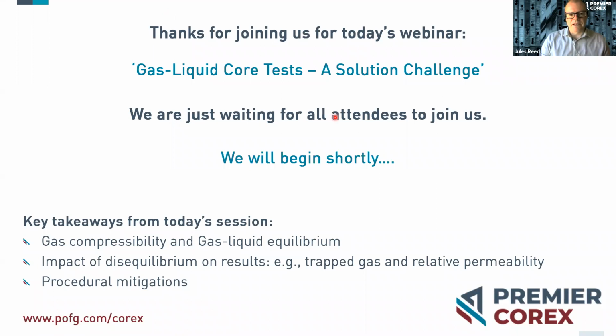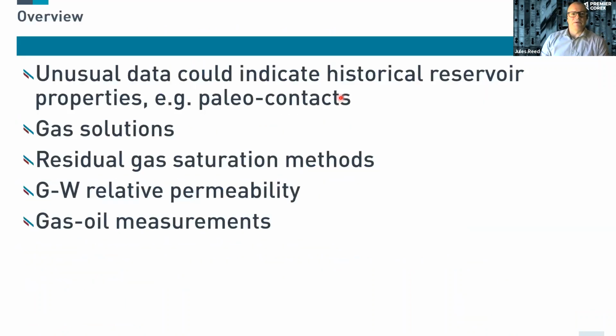As Jennifer said, today I'll be discussing gas-liquid core tests and some of the challenges and potential difficulties or issues that you may experience.